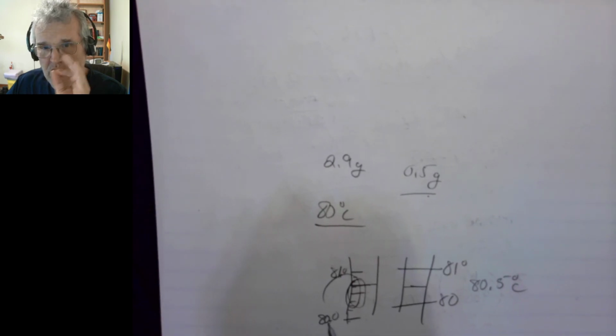So do that. Put it in there, get it heated up in the hot water to at least 80 degrees, stir it around with your test tube, get that benzoic acid to dissolve in there, take it out, keep stirring it, do the same thing. Record the temperature. Now, one thing, when a pure substance freezes, it's going to hold its temperature.